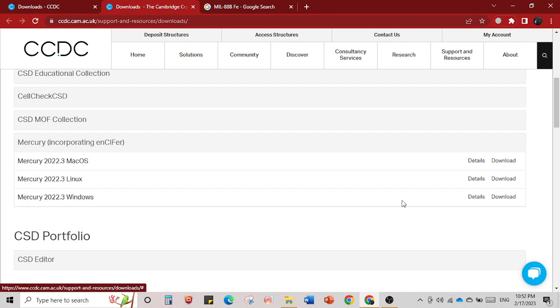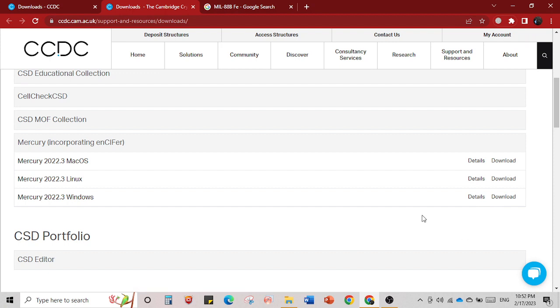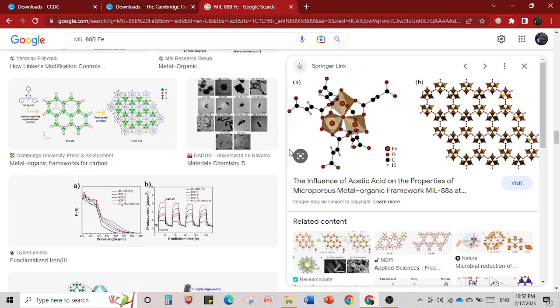When you click Mercury, you will have three versions for downloading: one is Windows, second is Linux, and also Mac OS. It depends on which operating system you use. Click the respective one — it is a direct installation. If anyone feels any difficulty with installation, please drop your questions in the comment box and I will solve it.